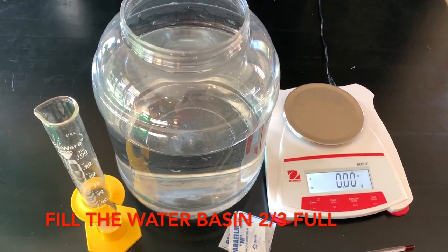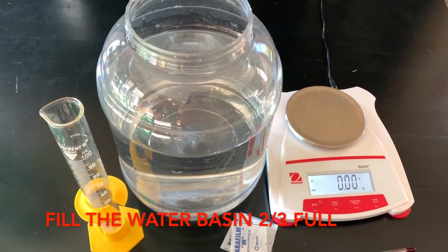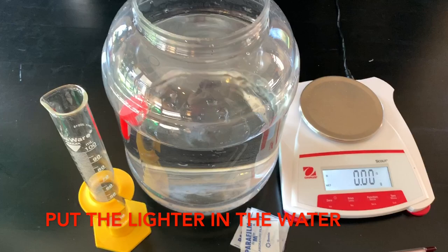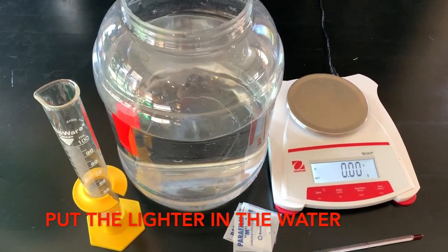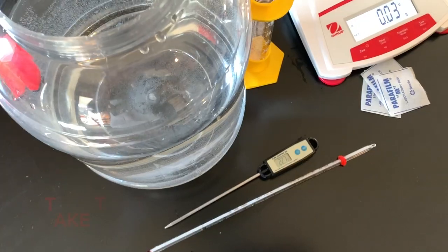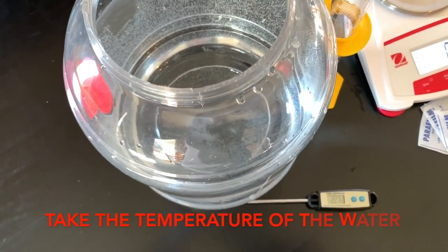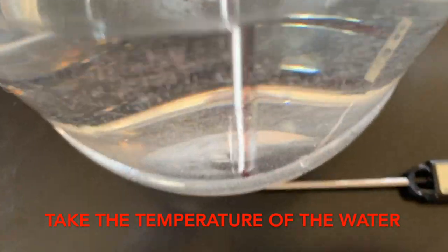Fill the water basin 2/3 full of water and then put the lighter into the water for two reasons. One, to reach the same temperature as the water, and two, to avoid errors by having water in all the cracks and crevices of the lighter. Next, take the temperature of the water before you continue.